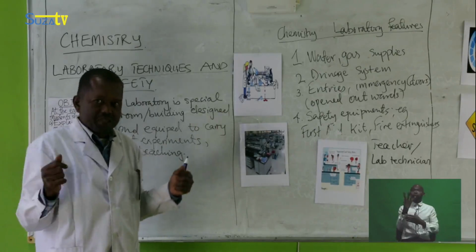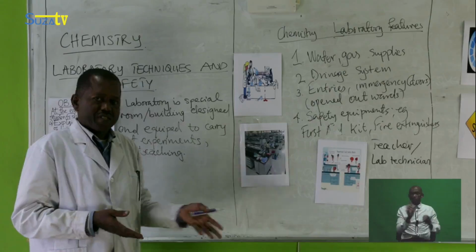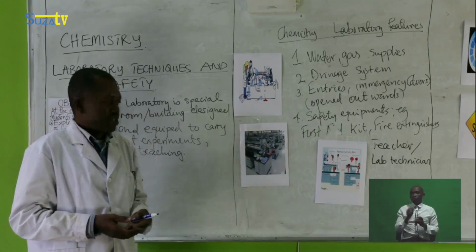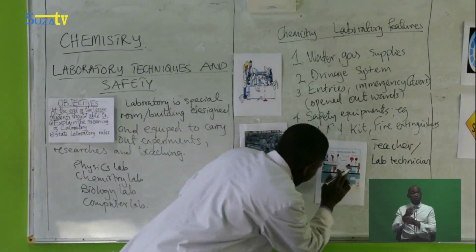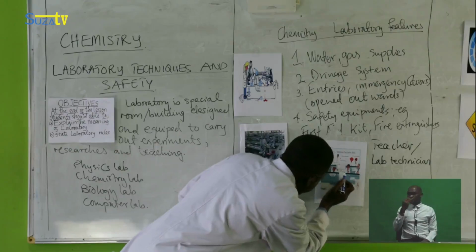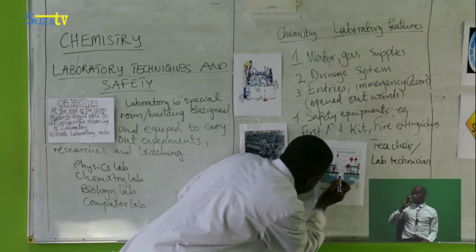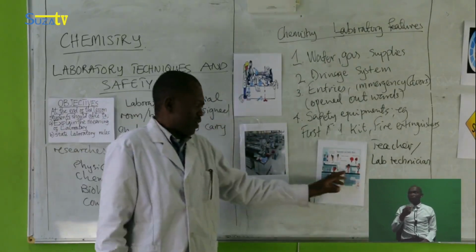Maybe you know that, but you are not required to do that. Maybe that's not the purpose of entering the laboratory to do such kind of experiment. So don't do mad experiment. Also we have don't eat or drink, don't taste or sniff the chemicals.